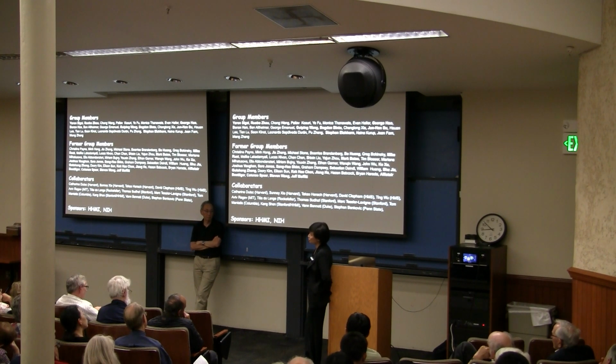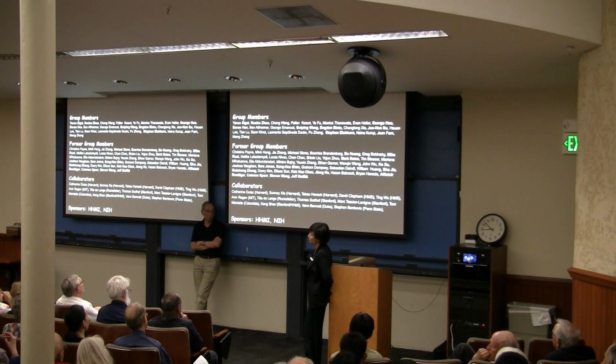But if you are linking a fluorescent probe directly to the protein molecule in a living system, then we often do test whether that connection can happen, between a fluorescent protein genetically fused to the protein, or some tags called SNAP and Halo tags and so on, and then you link a dye to it. In those cases, we often do test whether the function of the protein in the living system has been perturbed by the labeling.